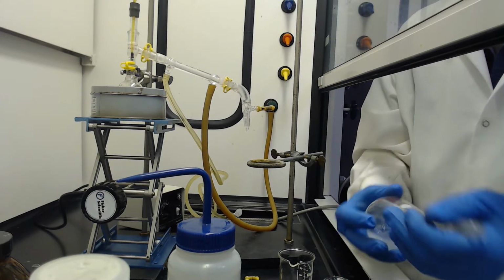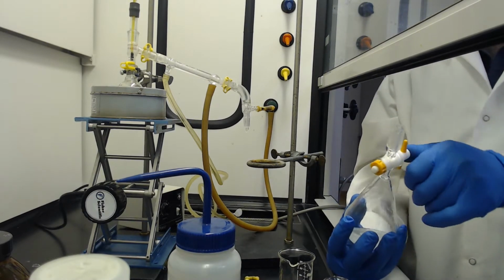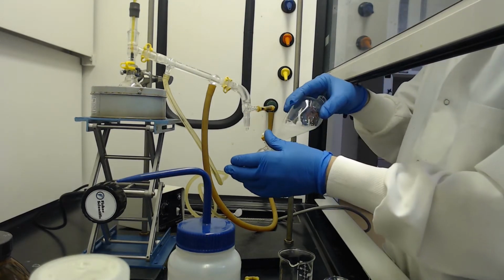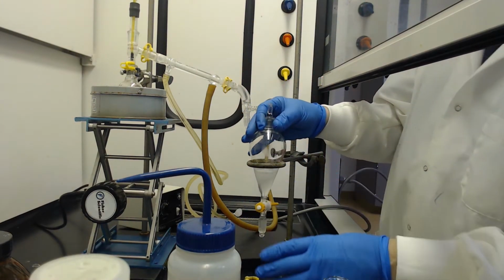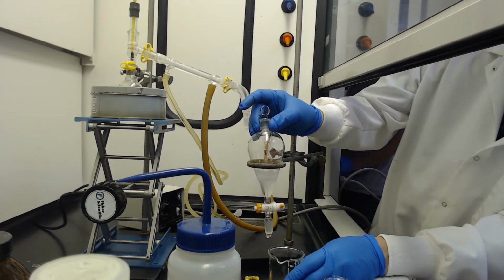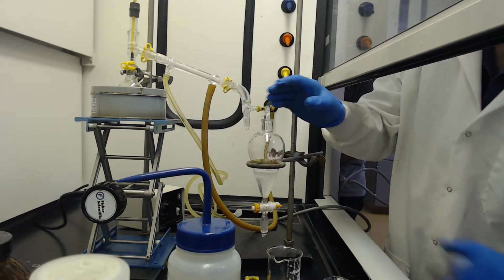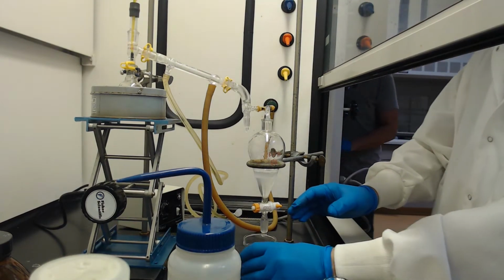So I'm going to seal that up, give it a little shake. Okay, we're not seeing much gas evolution, so that's good. And we can give this a nice shake. And then we'll put it back on here. And we'll let that emulsion, you see there's a lot of emulsion there, separate. We'll give it a little bit of time. And again, when you drain it, you want to make sure that this is loose. Well, that emulsion, okay, so that looks like it's gotten out, and we're going to save this.